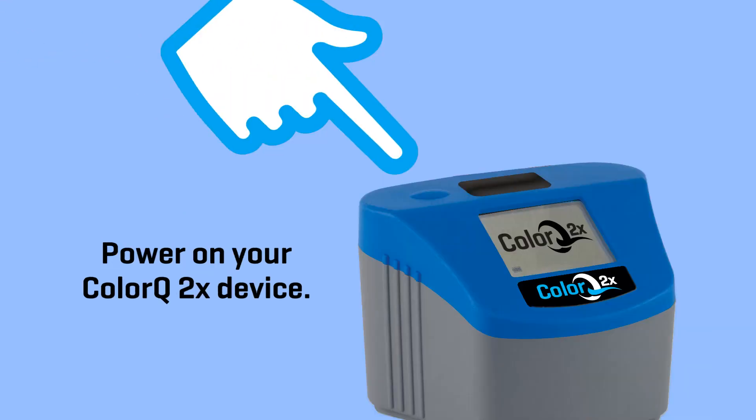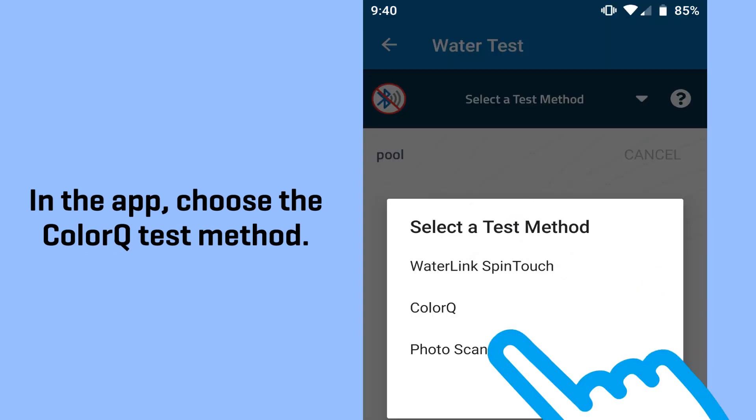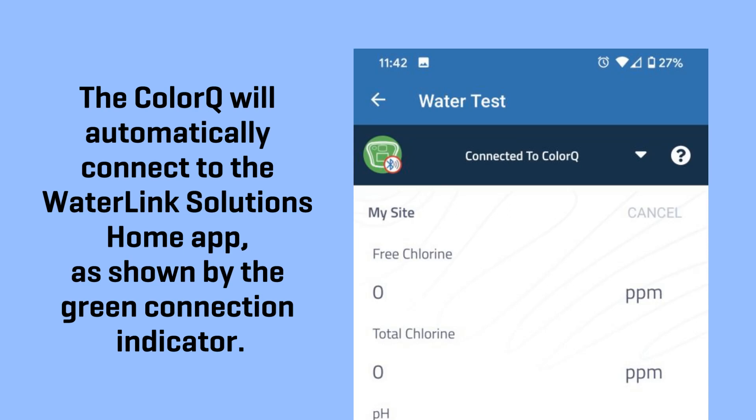Power on your ColorQ 2X device. In the app, choose the ColorQ test method. The ColorQ will automatically connect to the WaterLink Solutions Home app, as shown by the green connection indicator.